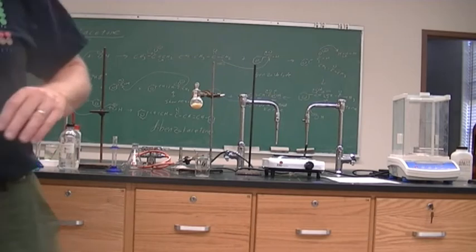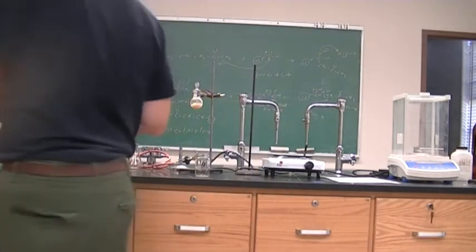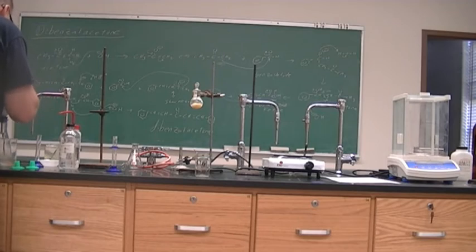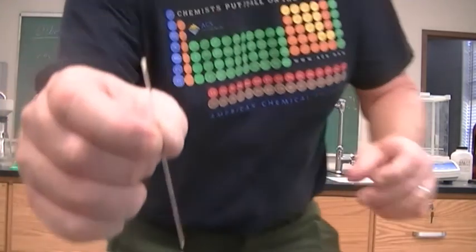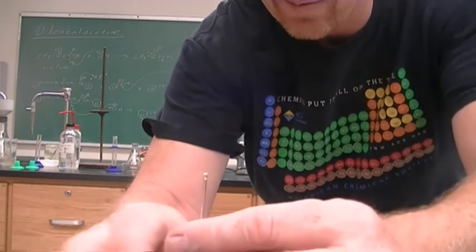Alright, so I'll get a capillary. Alright, we're going to do a melting point. I got some of the yellow crystals and tap them down to the bottom.